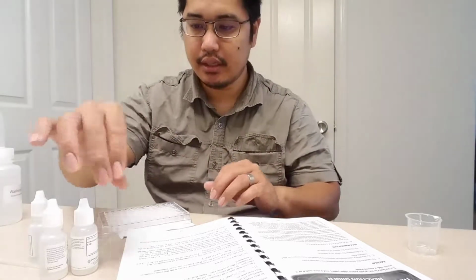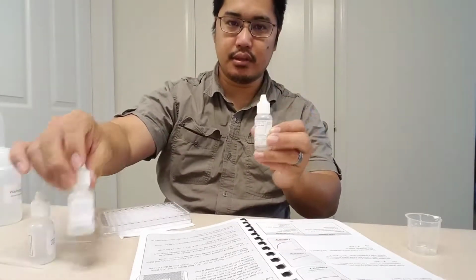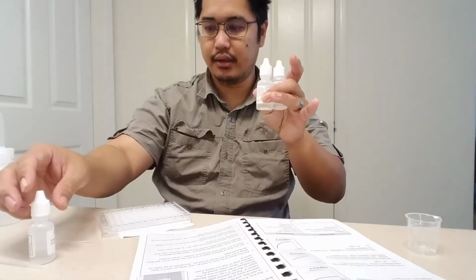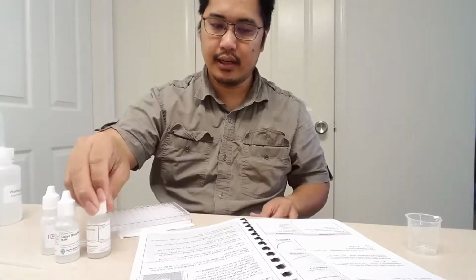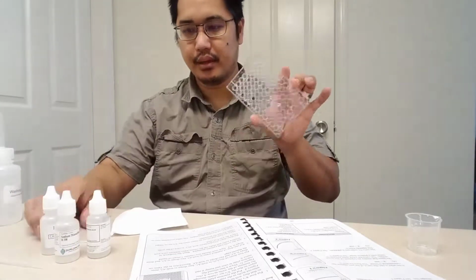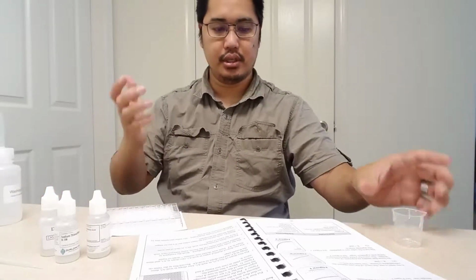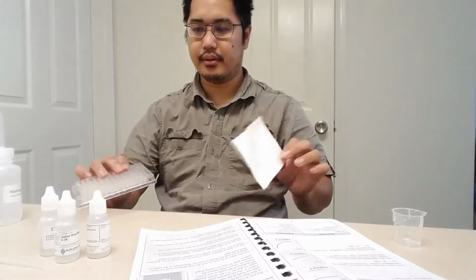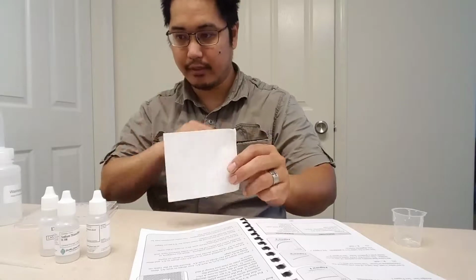So here's what you're going to need. You're going to need some hydrochloric acid, some sodium thiosulfate, some distilled water, preferably in the little dropper bottle, a 96 well reaction plate, a plastic toothpick, a small beaker, a stopwatch, white paper, and graph paper. I just have a white piece of paper. You can just use regular printer paper or whatever.